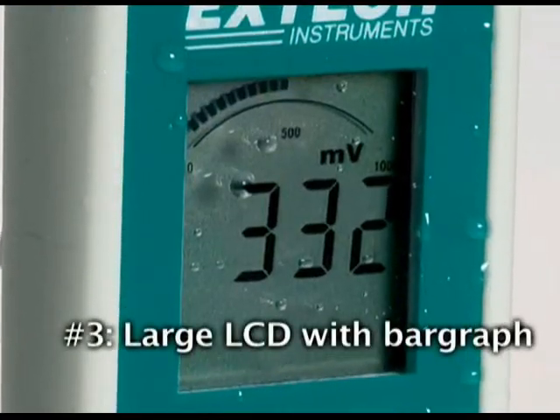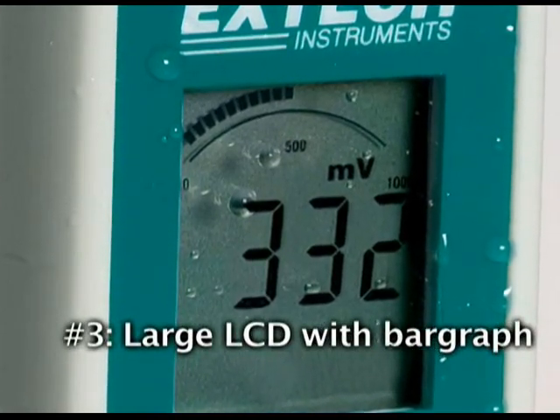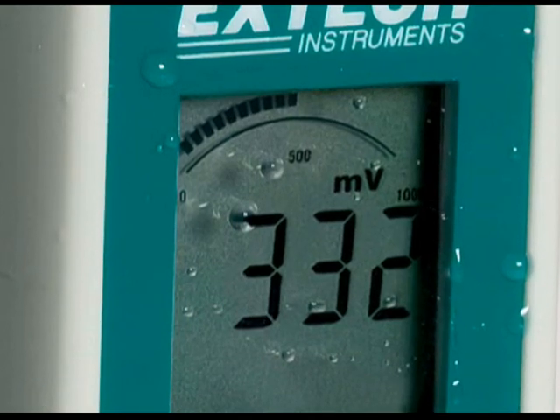3. The large LCD displays the reading in millivolts while the analog bar graph offers a visual graph displaying the trends of the oxidation-reduction reactivity period.